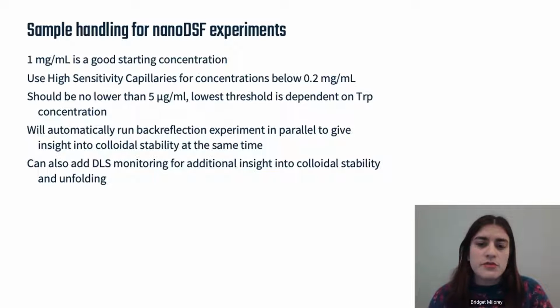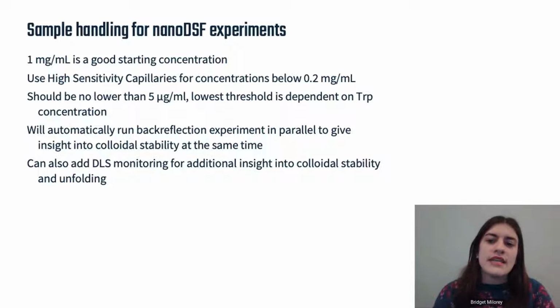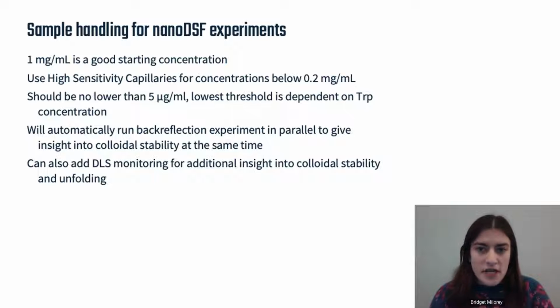So this means that your samples will require some light cleanup after lysing. And also keep in mind that any other protein, such as a chaperone, will also have an unfolding shift in nanoDSF.